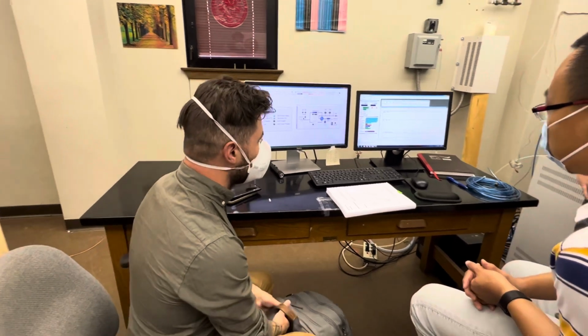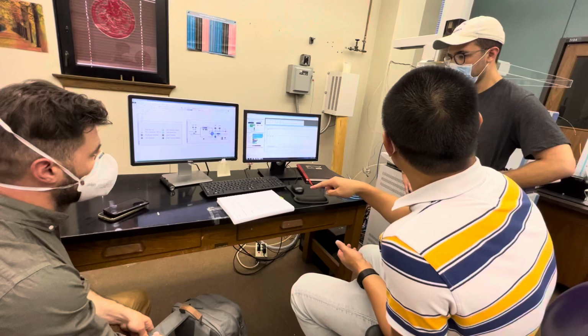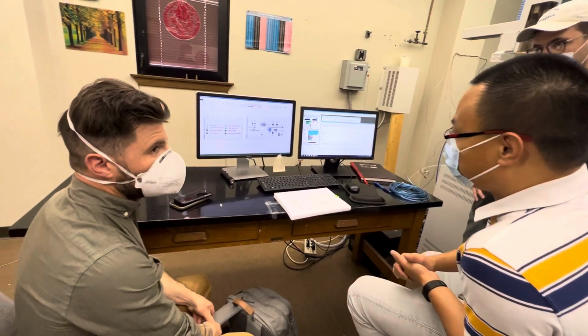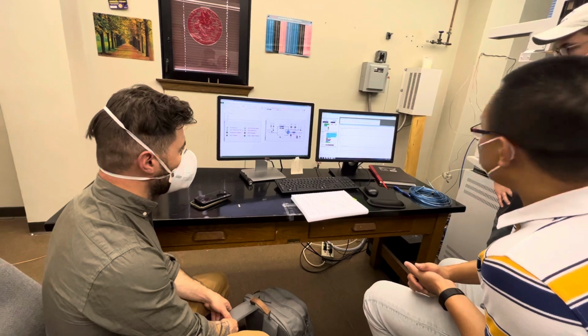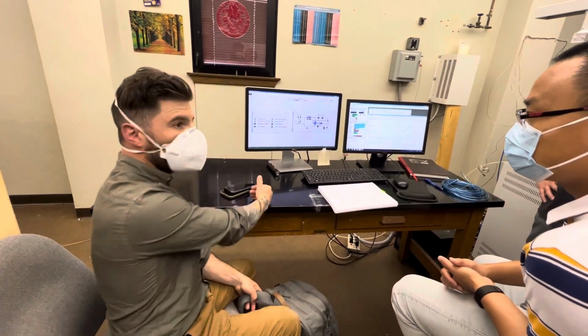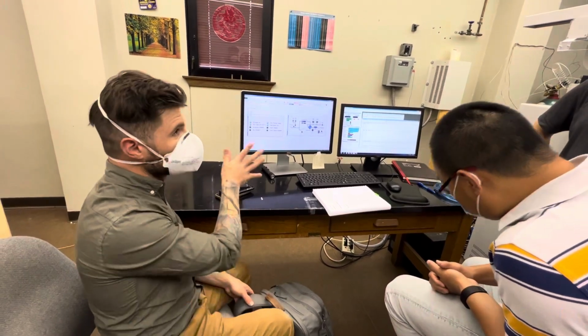Okay, that's a correct suggestion. Let's do that normal checking and also put it on the Excel. And then we can back up maybe. Yeah, I back it up, and I do that every quarter with all the data, and at the end of the year, I plot all of the year's data and just see. And you'll see seasonal changes probably too.